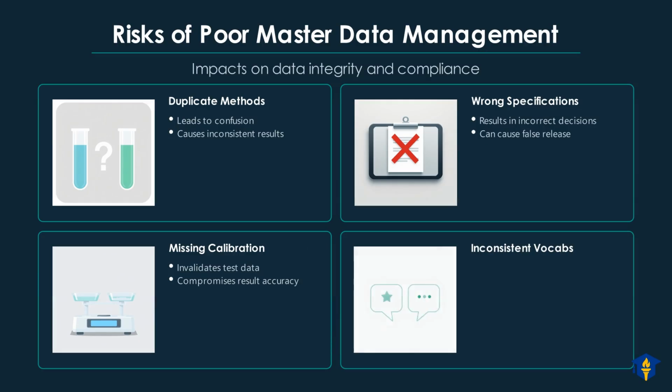Finally, inconsistent vocabularies, like different units of measure, create significant challenges. Such inconsistencies make it very difficult to generate accurate and standardized reports across the lab. They also create difficulties when attempting to identify trends or perform comparative analysis of data.